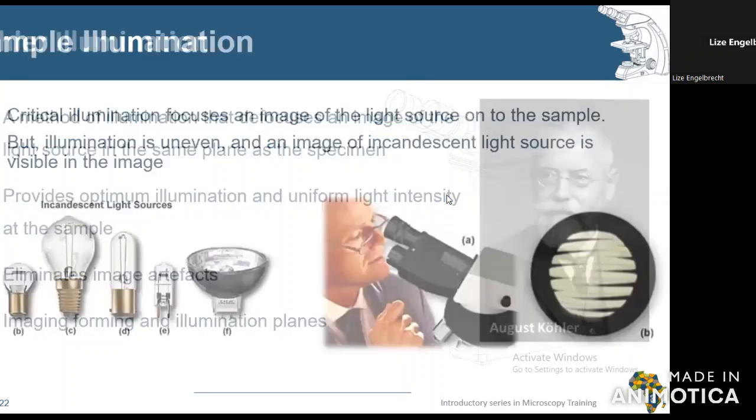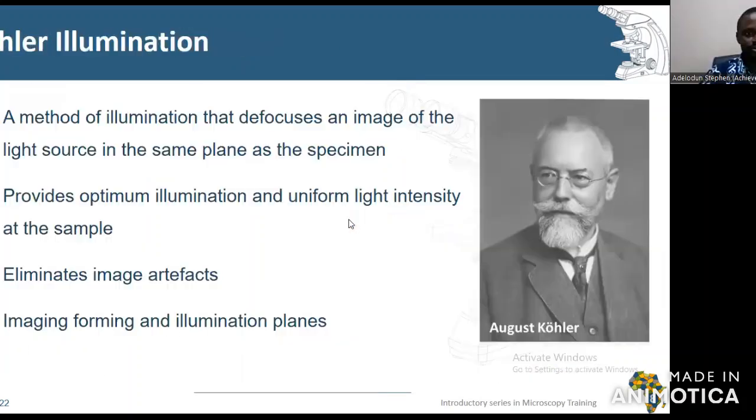Okay, let me switch it off then. Can you restart from the Köhler illumination, please? We've heard that manufacturers put the components in a line. All right, thank you very much.